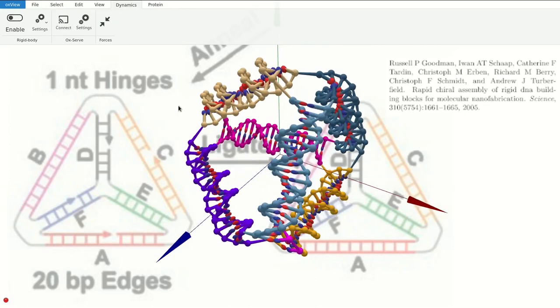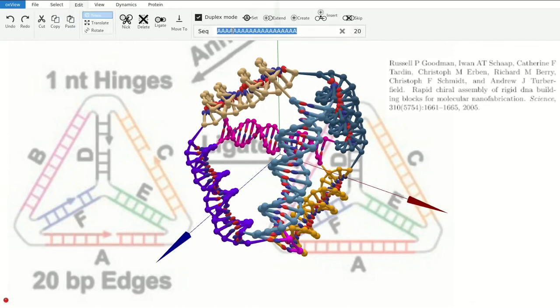If you want to, we can also make some edits here. If I want to add these one nucleotide hinges, maybe a T at this point, let's just insert that there and then click and insert. You can also skip certain ones if you don't want to have them there. But I'm not going to do the whole thing now.